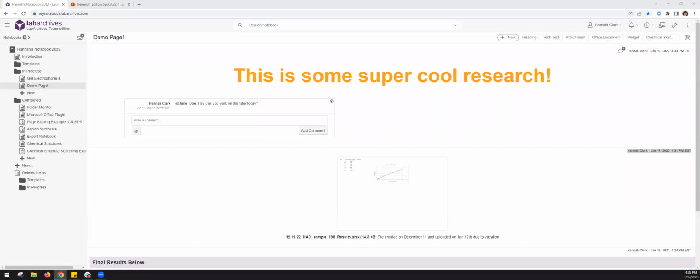It's very common that folks just take pictures. My favorite, it was a presentation by a researcher a few months back, and she showed her real lab notebook. And one of the pictures in the lab notebook was just a picture of her glove, because she took notes on the back of her glove and just took her phone, took a picture. And hey, it's not ideal to write your notes on a glove, but it happens. Sometimes that's the closest thing by. So, it works. At least it got in there somehow. And then you don't have to worry about when you throw out the glove. At least you have some record that you wrote the notes down.